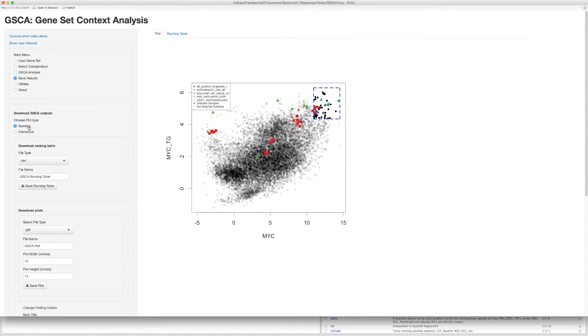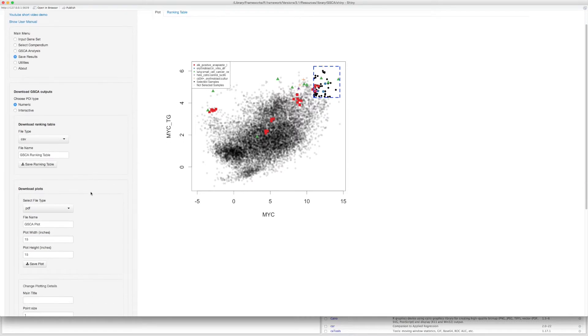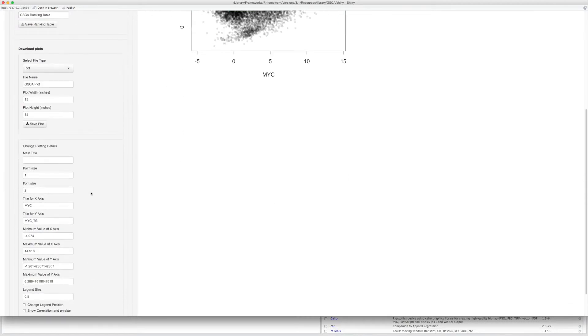Then you can save the ranking table and see it via a TXT file. GSCA offers a bunch of options for you to customize your plots before saving them.